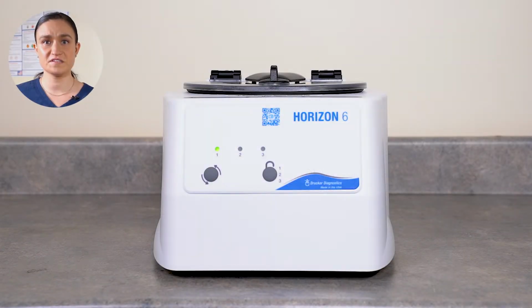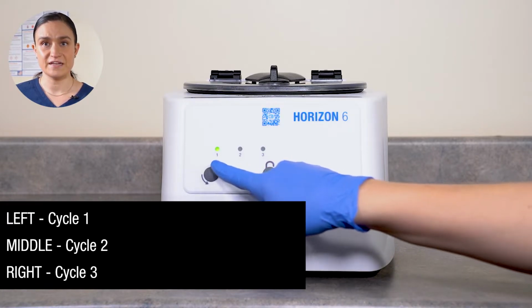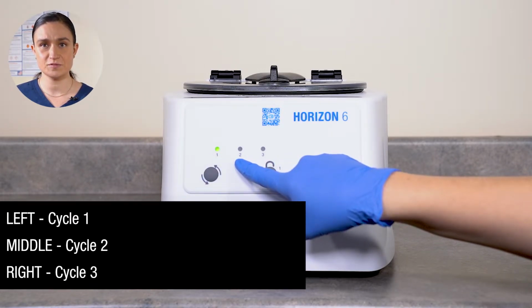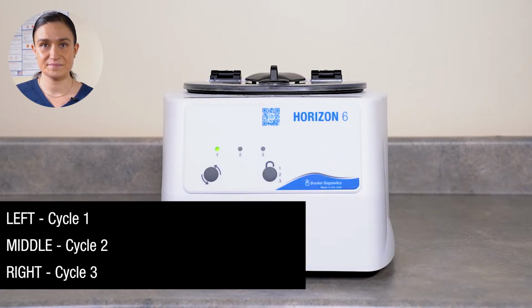To check which of these cycles is selected for spin, look at the number below the illuminated LED. If the first LED is illuminated, your centrifuge will spin Cycle 1. If the second is illuminated, Cycle 2 will spin. And if the third is illuminated, Cycle 3 will spin.